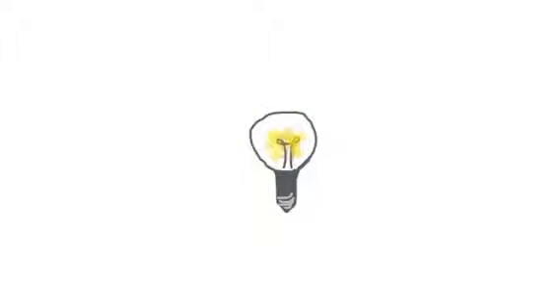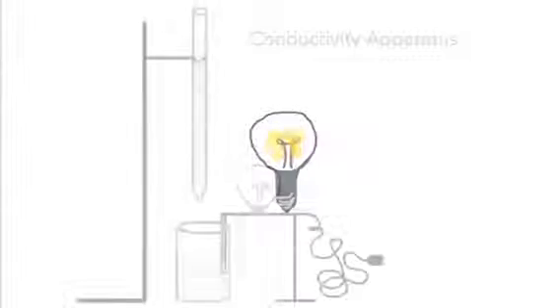Unfortunately, we do not have access to an apparatus which could help us light a light bulb using the current in this solution. But in a perfect world, such as Titration Nation, we could use this demonstration to show the relationship between concentration and conductivity by lighting up a light bulb.